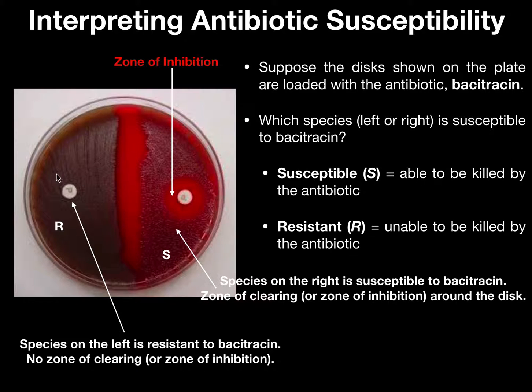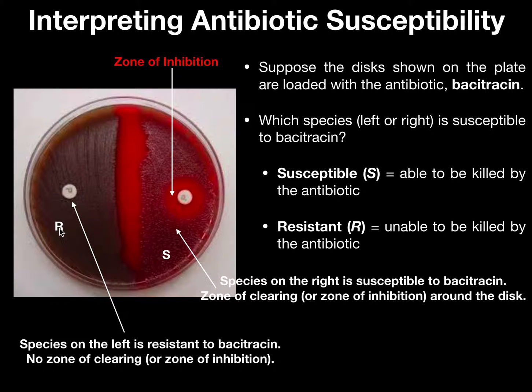The bacterial species on the left side is resistant to bacitracin. The reason it's resistant is because around this disc, there's no clearing — no zone of inhibition. There's just clean growth right around the disc. Therefore, the species on the left is resistant, meaning it's unable to be killed by the antibiotic. For resistant, we give it the letter R. When you record the results of either a bacitracin or Optochin test, you're going to use either R or S — S for susceptible (zone of inhibition present) and R for resistant.